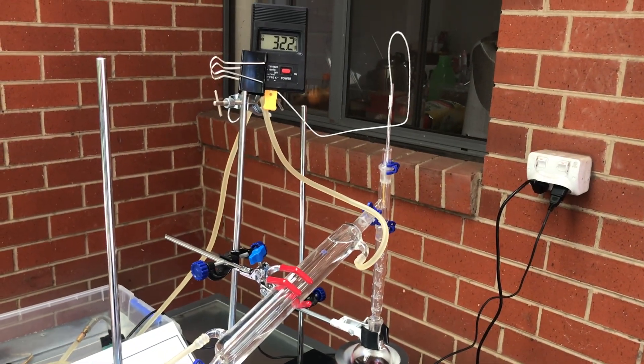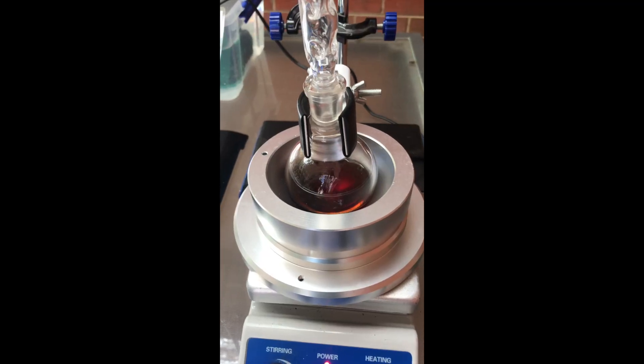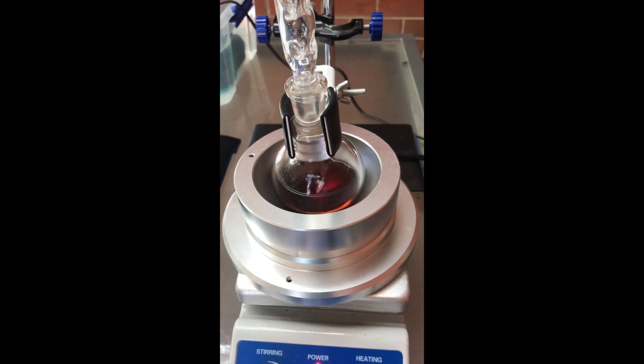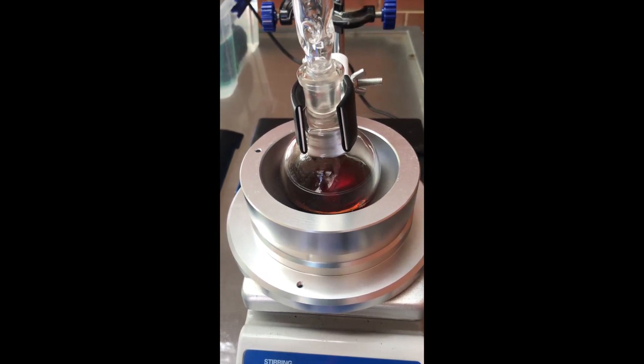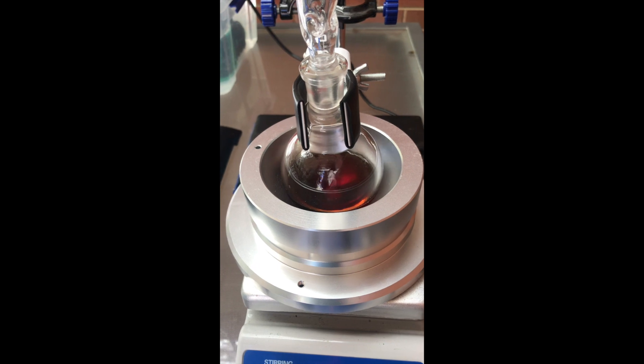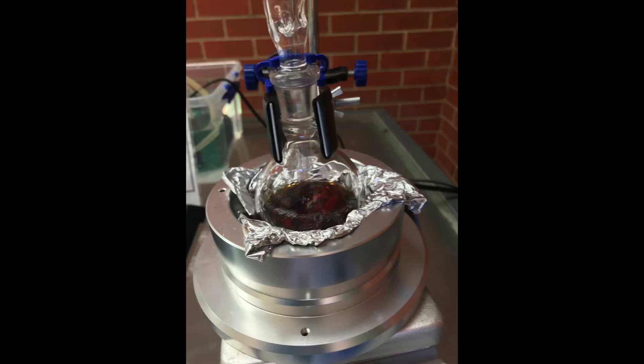It was taking a long time to reach acetone's boiling point of 56 degrees celsius so I covered the bottom of the flask to insulate it with some aluminium foil to make it heat up faster, which actually resulted in protecting the flask from breaking as well.